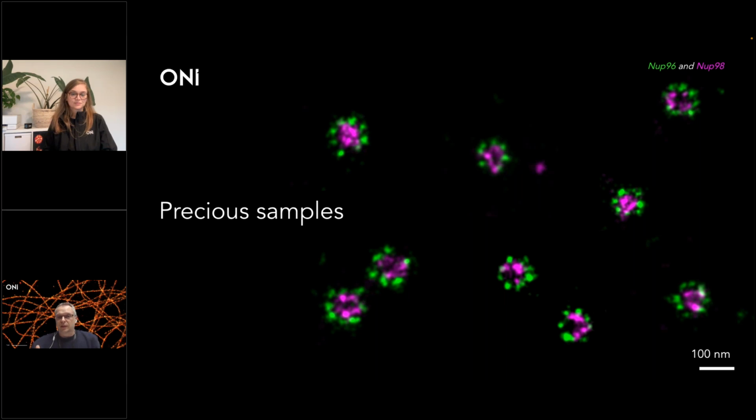However, it will be very difficult to image them with a single molecule localization microscopy, because even if you apply 3D imaging, the depth is around 1 micron. So it will be very, very hard to image the full organoid. But yes, there is a difference: imaging the behavior of cells or the organization of receptors in a 2D setting might differ from the 3D setting.